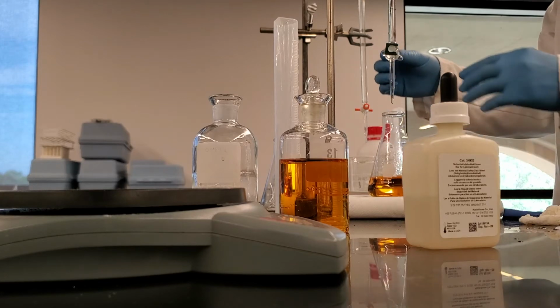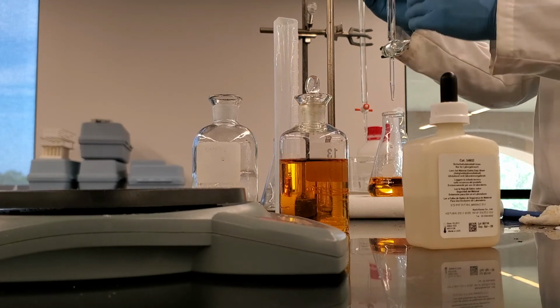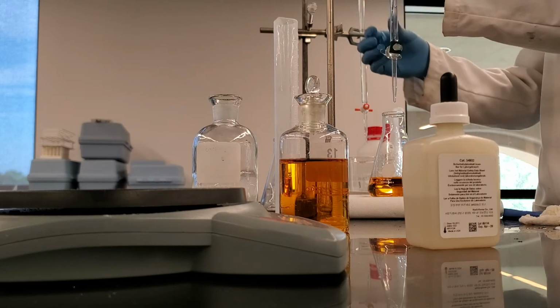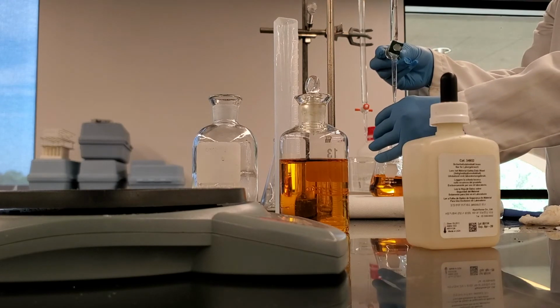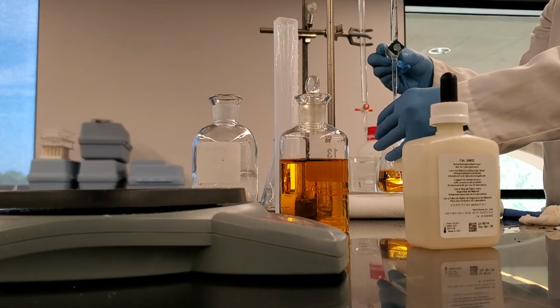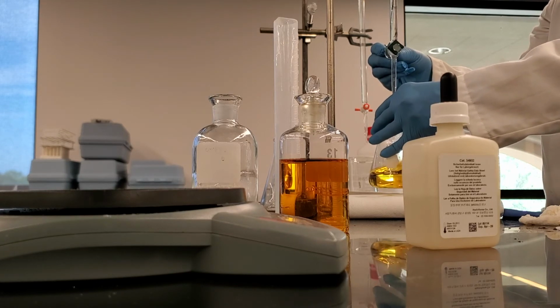So to titrate, I'm going to turn this around a little bit. There's kind of a screw kind of knob. If you turn it gently, you can control the flow of the sodium thiosulfate. I'm right-handed, so I'm keeping the screw on the right side, hold the container on the left. I'm going to open it. So at this point, it goes like drops. If I want to increase, I can turn it a little bit more. Now I'm delivering too fast, so I'm going to do some more time. Okay.